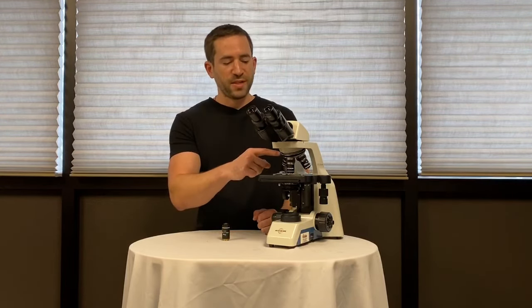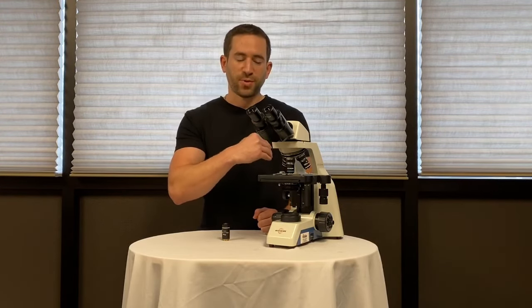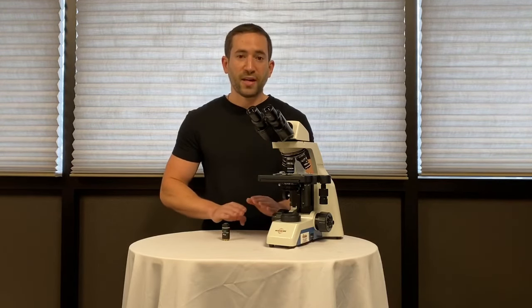A reverse style nose piece means the unused objective is faced backwards and away from a student to protect the lenses. The 40X objective is flush mounted making it easy to wipe clean if you get any oil on it.